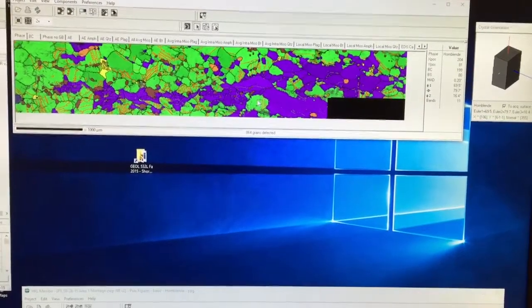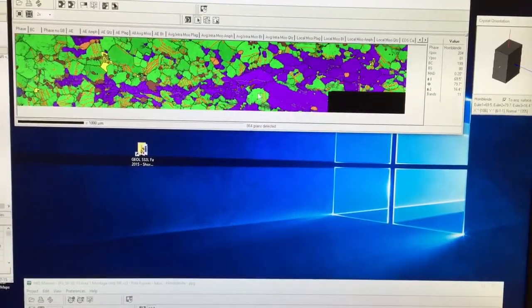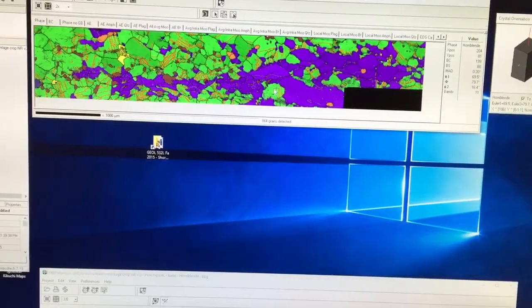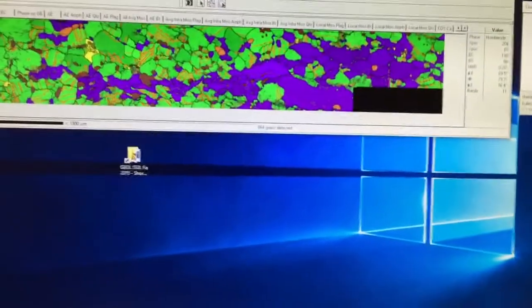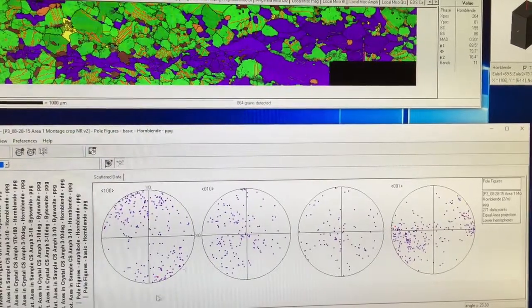They're called pole figures. And you'll have to remember a little bit of mineralogy to navigate the pole figures. I'm going to show you the orientations of the A, B, and C axes of the hornblende in these lower hemisphere projections. It's like looking into a cereal bowl, and if you had a pencil, where within that bowl the pencil dot would hit. That's the orientation of the axis. These are what are called pole figures. Here's the lower hemisphere bowl.